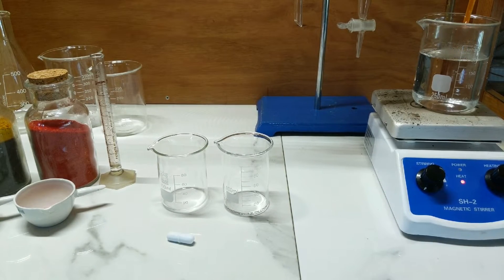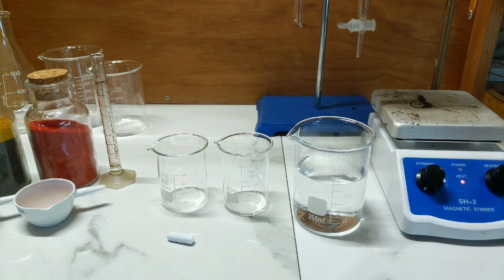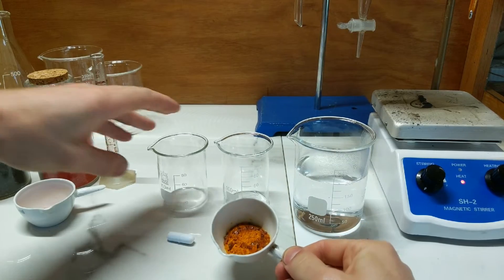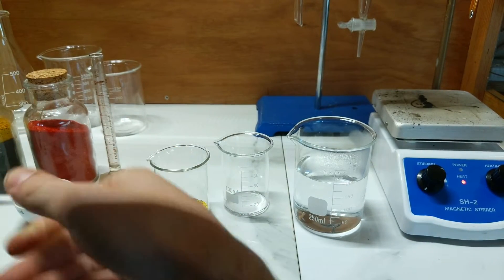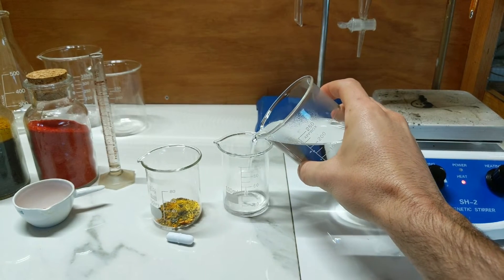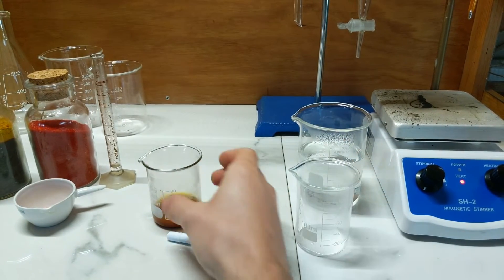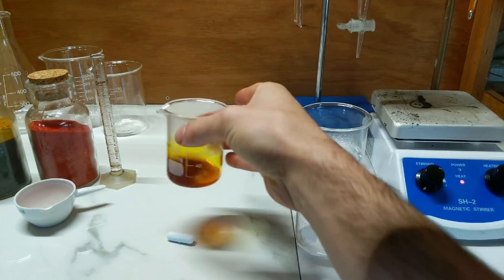The first step is to reduce the ferric chloride to ferrous chloride. Five grams will go into the beaker and be mixed with 20 mils of 60-degree water that has been heating up on the side, and stirred until we have a good solution.